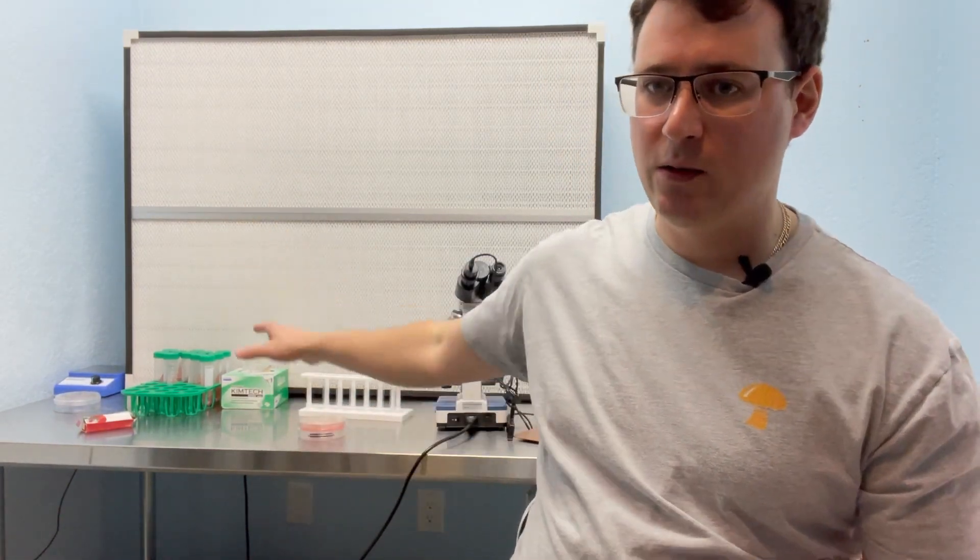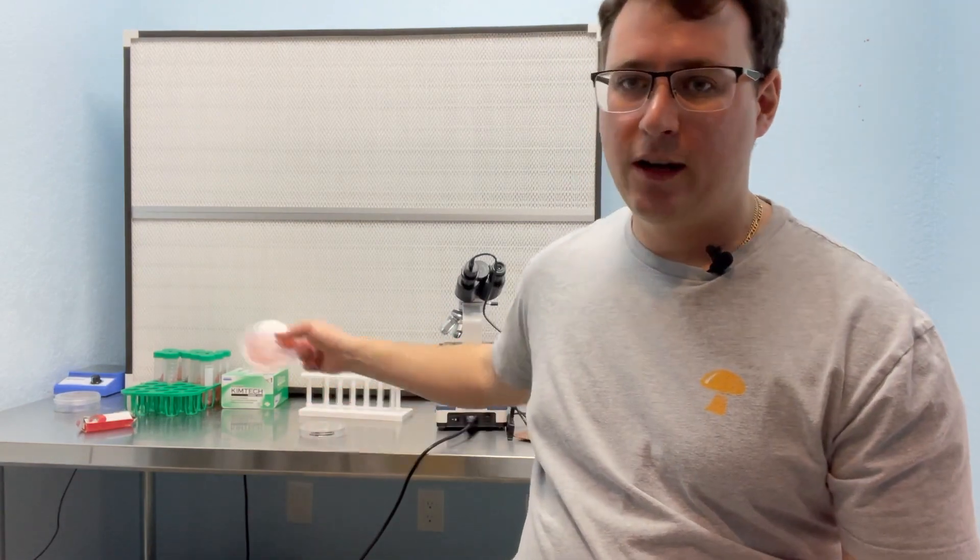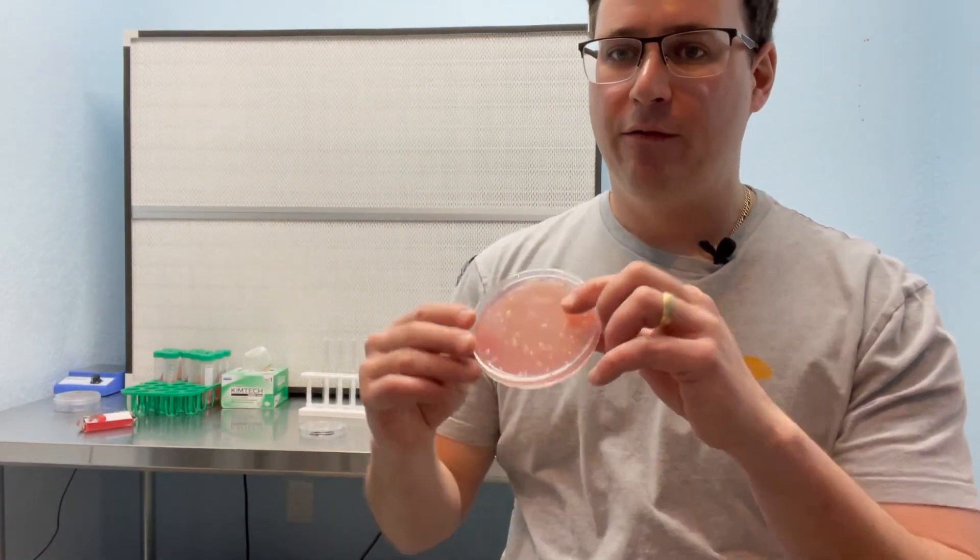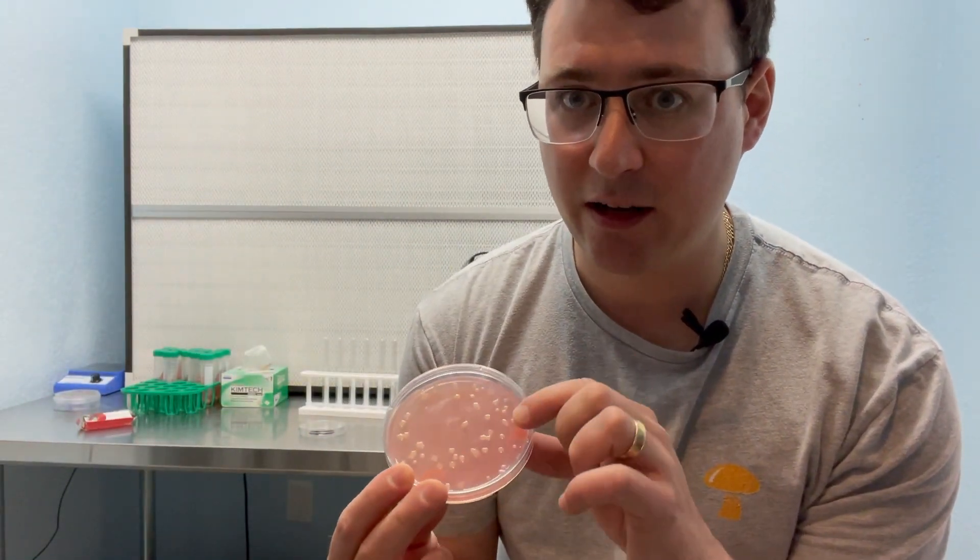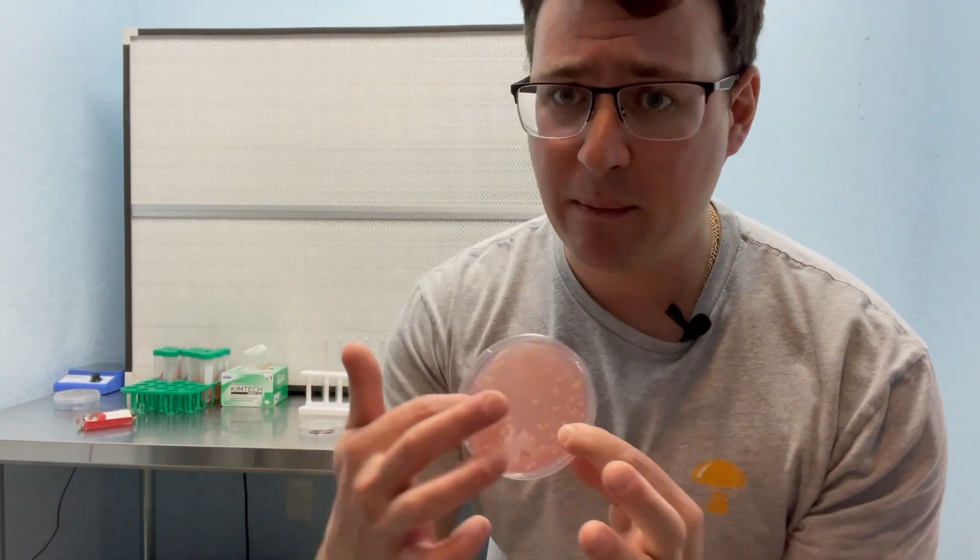If you're cloning mushrooms and you're cutting a piece of tissue onto a petri dish, that is one CFU. Or for example, on this dish which is contaminated with yeast, each one of these colonies started from a single CFU.